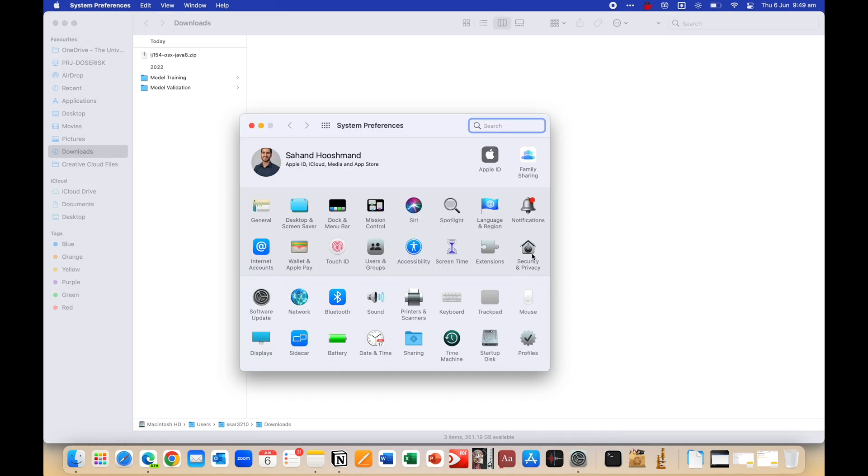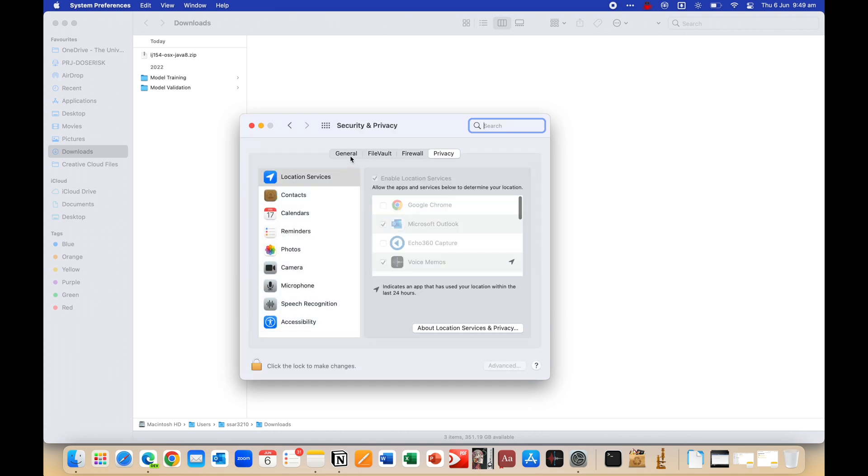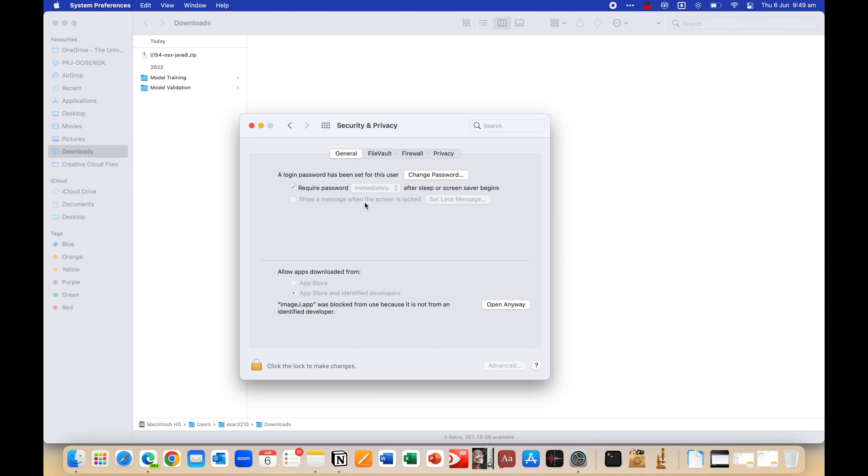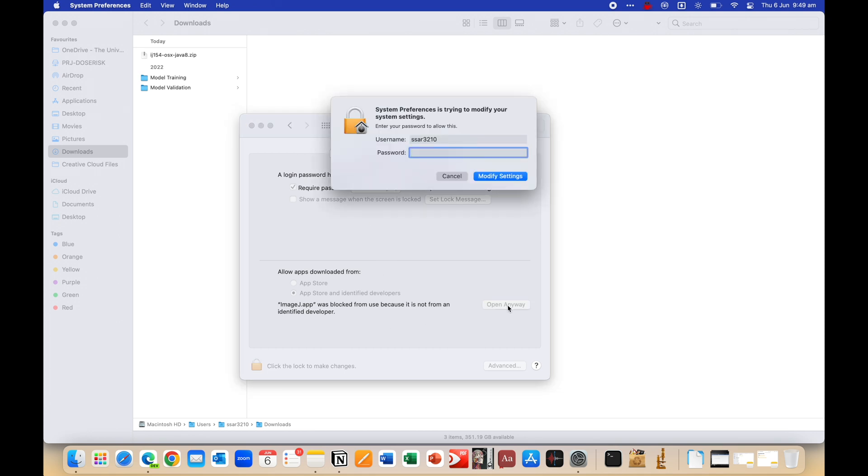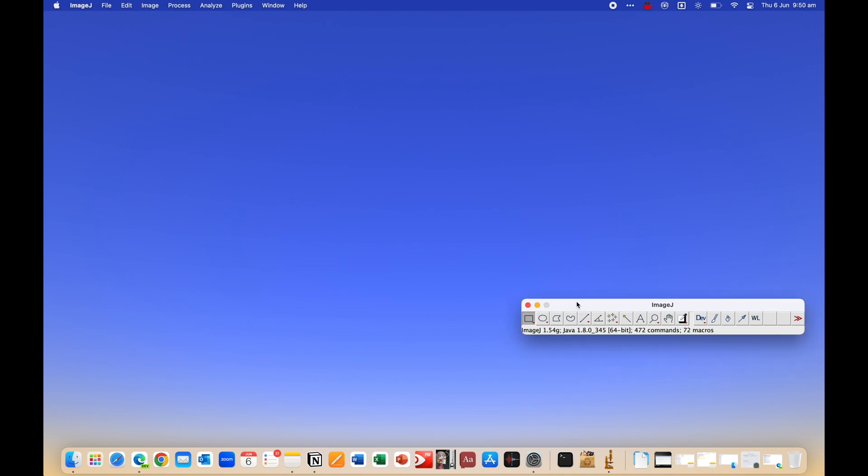just go to settings or system preferences or even system settings, depending on what version you're on. Then click on security and privacy and then make sure you're under the general tab. And then you should see this at the bottom where it's identified an app trying to open. So just click on open anyway, and it'll then ask you to make sure and click on open. And that's it.